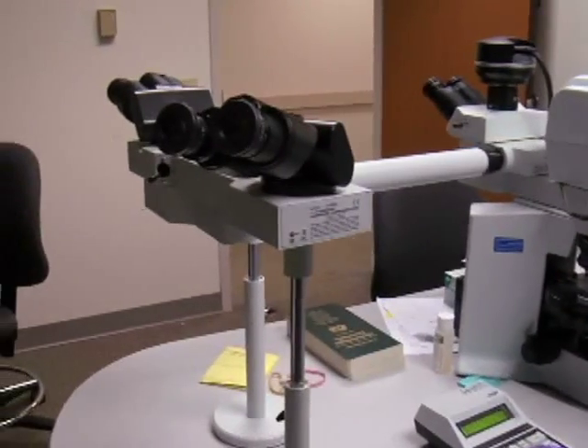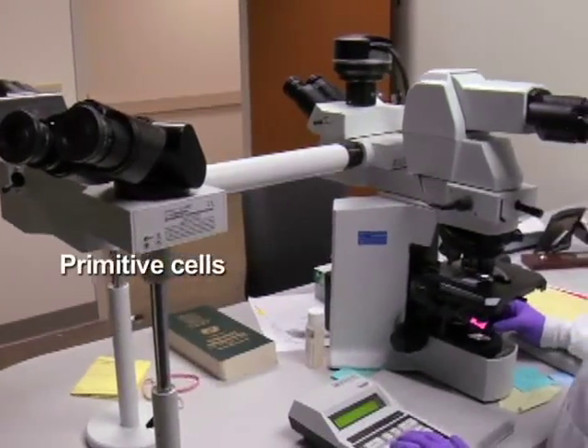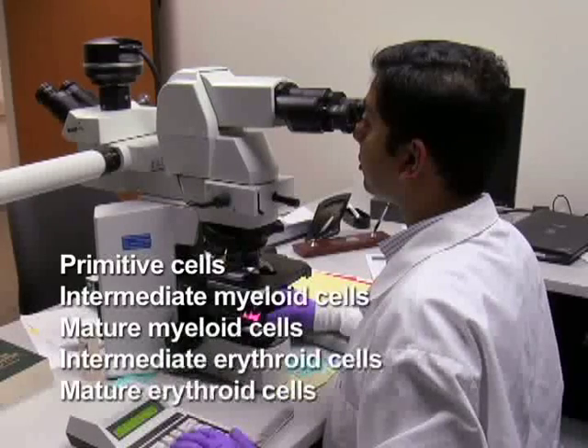For the purposes of this experiment, cells are divided into five categories: primitive cells, intermediate myeloid cells, mature myeloid cells, intermediate erythroid cells, and mature erythroid cells.